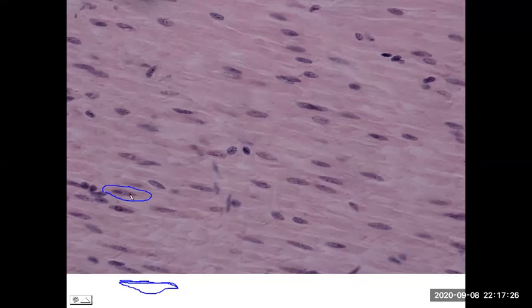And then you see the prominent staining here in purple. There's only one nucleus per cell. So the nucleus is the one trait that we could see and point out. So there's just a large mass here of multiple smooth muscle cells, and the nucleus is the one key distinction that we could see under the microscope.